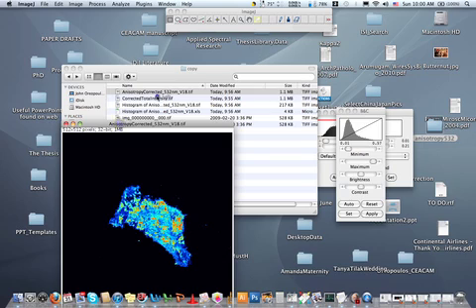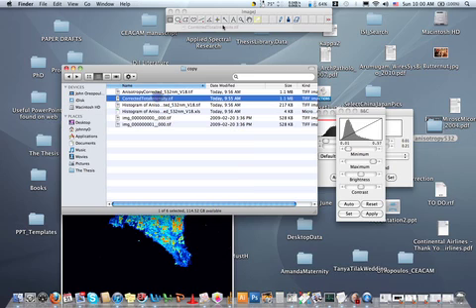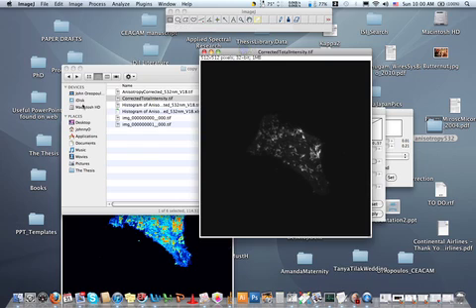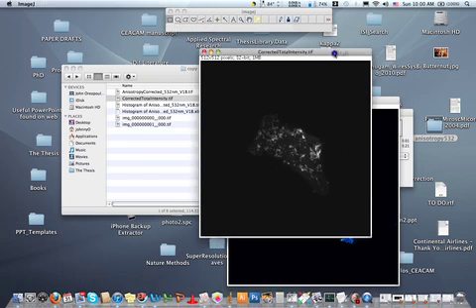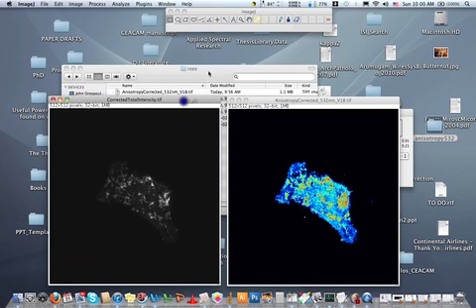And again, as I was talking about the corrected total intensity image, what we're going to do is have ImageJ run another macro, which I've given to you guys before, which goes along and takes each pixel from these pair of images and pulls them out into a table of data with two columns.